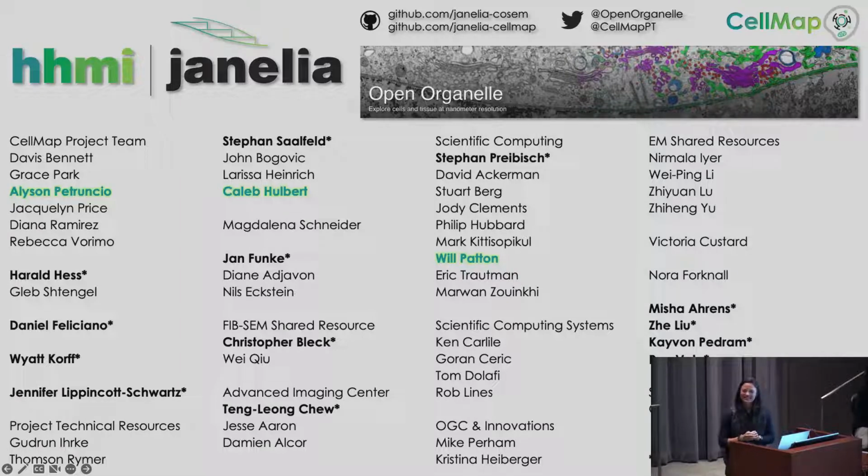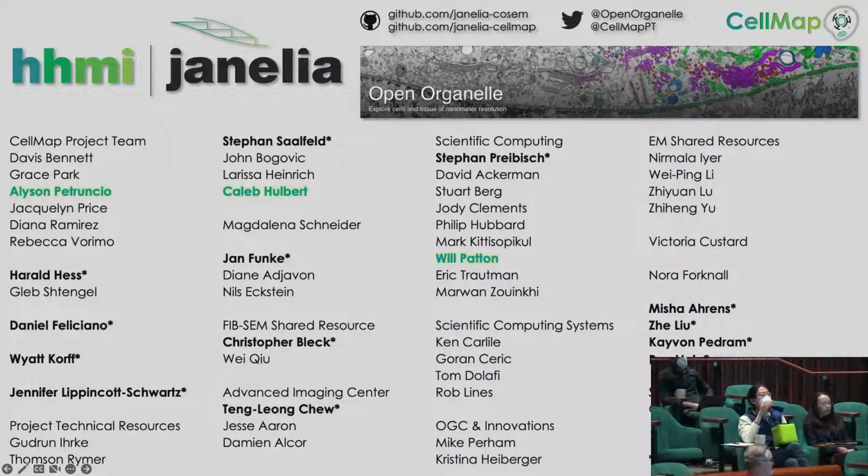Yeah. So something that got my attention was you're studying these portal triads, which have a very stereotyped geometry. And I'm wondering if you have tried registering these hexagonal units based on a portal triad. If you register them, in theory, you can superimpose all these units together, but the heterogeneity of the positions of all of these organelles should likely reflect the dynamics of how it fluctuates inside the cell. Have you studied that? Is that something you're interested in?